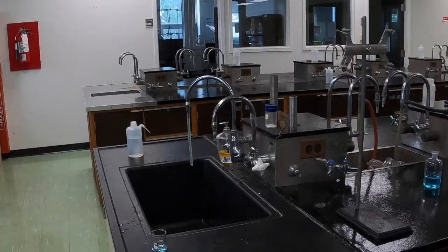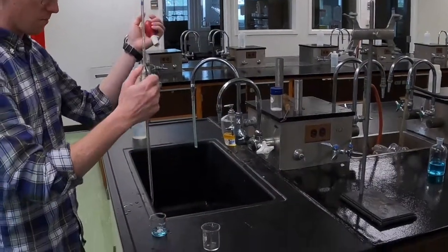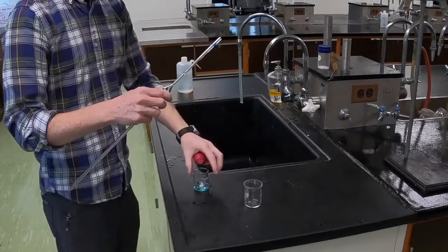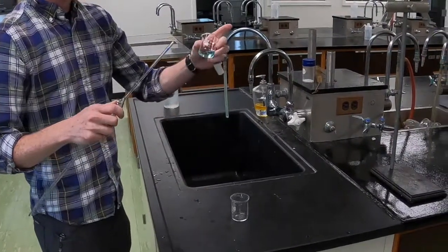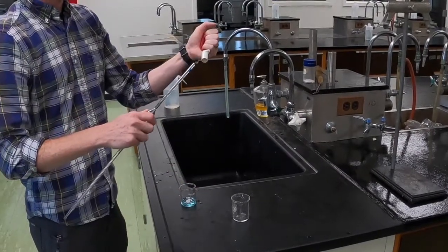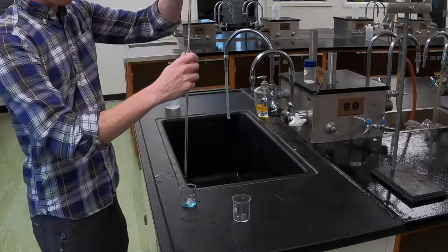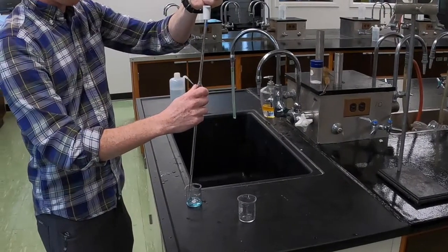Once you have your volumetric glassware, a pipette or a burette, fully rinsed with tap water and distilled water, you then need to rinse the inside of that glassware with a small portion of whatever solution you're planning on adding to it. The reason you do this is to get rid of any residual water that's inside the glassware, which would dilute your solution if you added it directly.